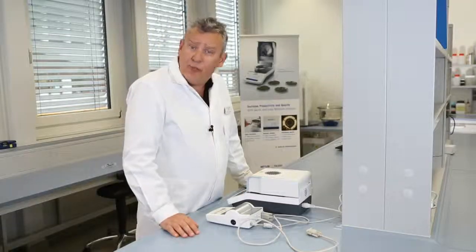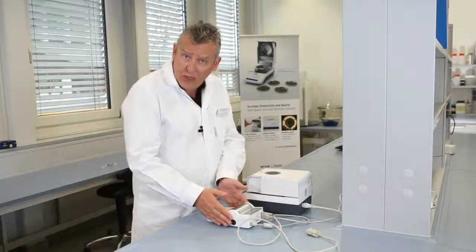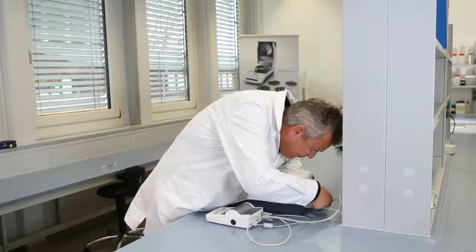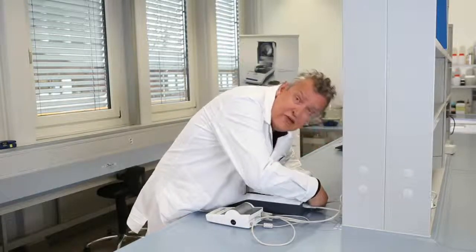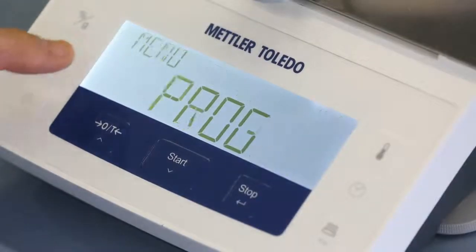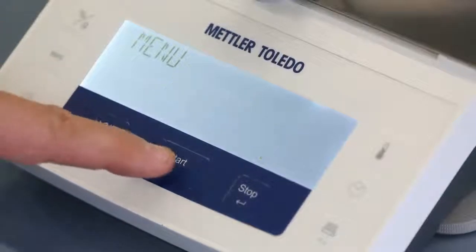If you want to print out your results, you can connect an optional printer using the RS232 interface on the back of the instrument. Enter the menu, scroll to print, and confirm that printing is on.